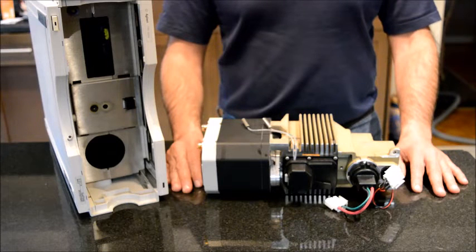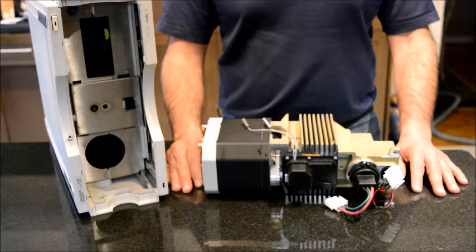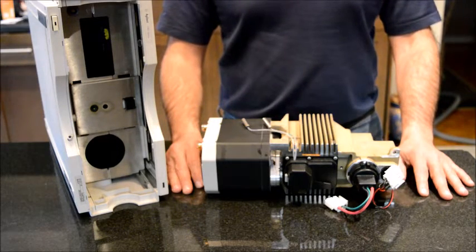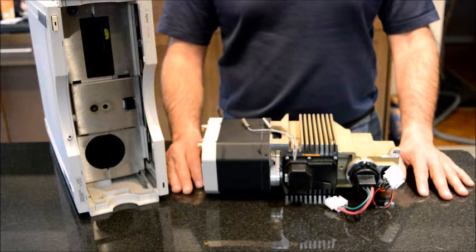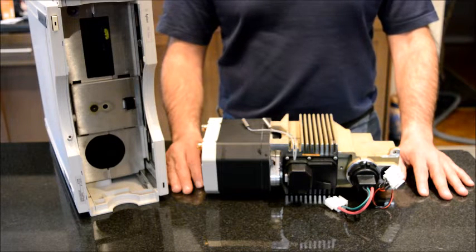Agilent provides two different types of UV detectors. One of them is the DAD detector, the one that I have in front of me, and the second one is the variable wavelength detector, or VWD. During the course of this video I will talk about the differences between these two.